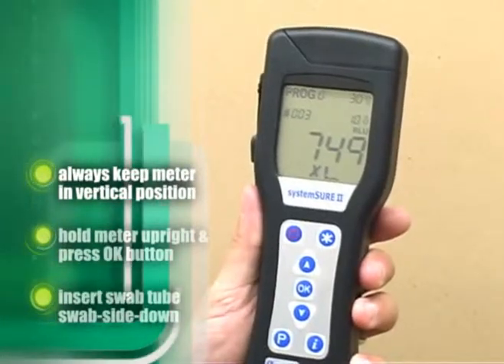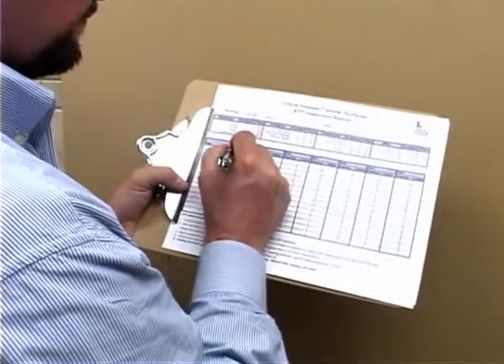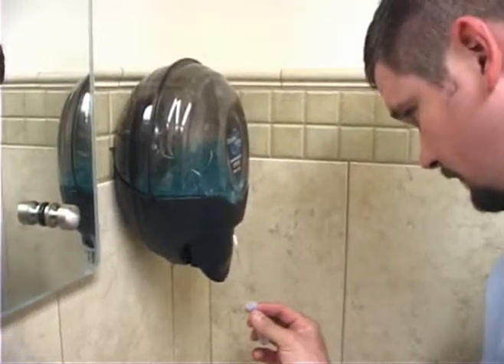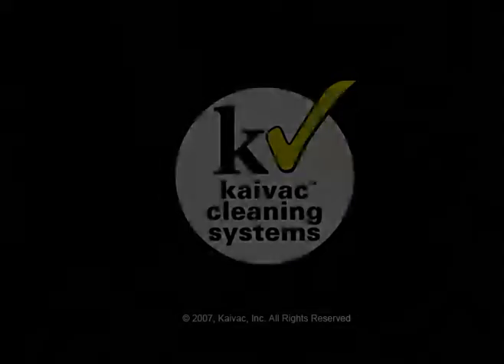Once the ATP reading has been displayed, record the location, date, reading, and your initials on the included form to begin tracking cleaning effectiveness. Following these simple directions will ensure you are retrieving accurate results in the areas you are testing, and will help you determine the effectiveness of your cleaning program.